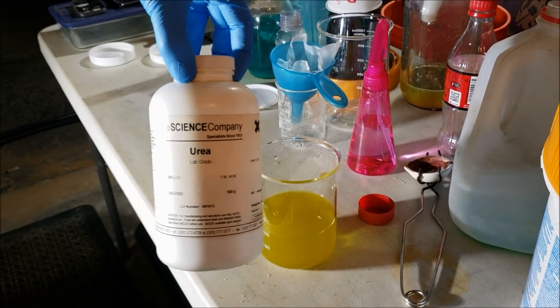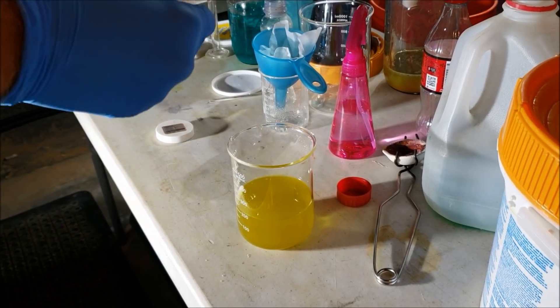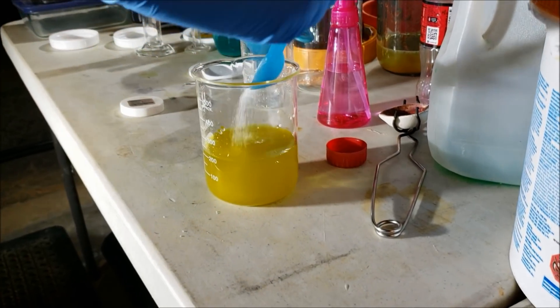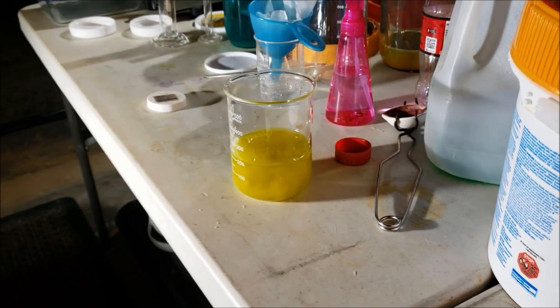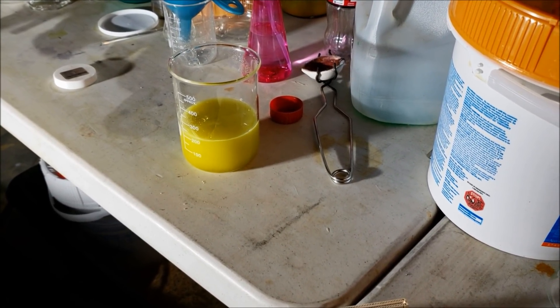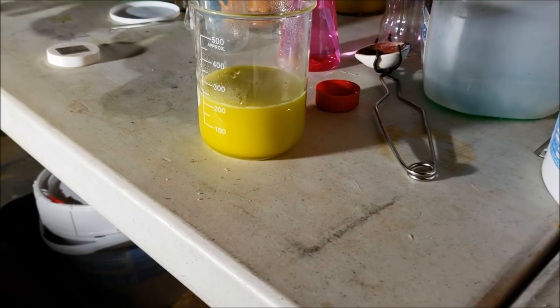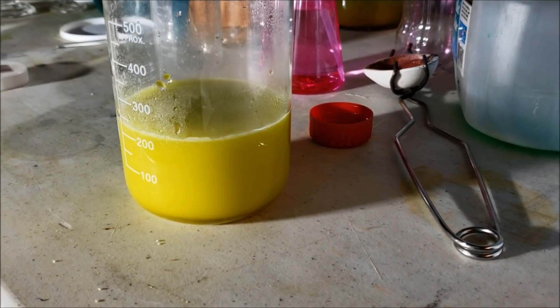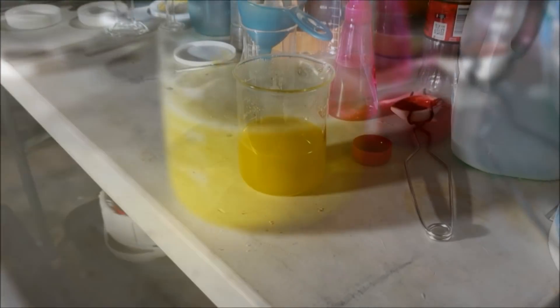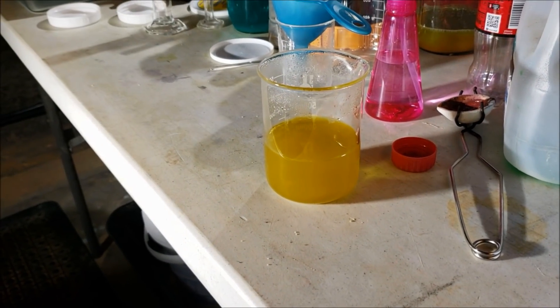I'm going to neutralize it with urea. Put a couple teaspoons in there, and you do it until it stops fizzing. You need to be vented — this doesn't smell good. We'll continue to do this until it stops bubbling. Now we've put our urea in here, so we've neutralized the acid.